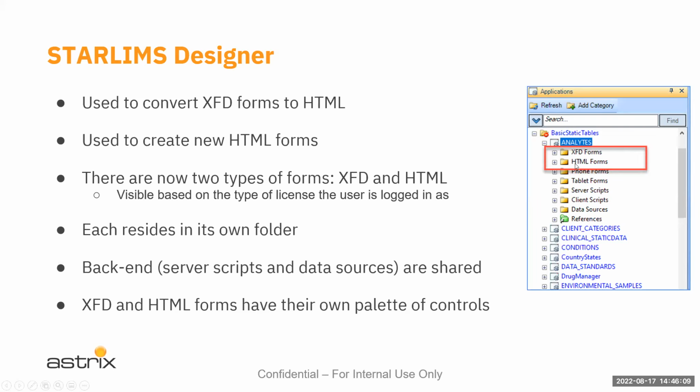So the form here, if you modify it, does not change, obviously, the HTML form. It's a copy. Okay, however, what didn't change was the server scripts and the data sources. That remains exactly the same. So really the upgrade to this new platform was on the presentation. Everything else stayed STARLIMS, right? So if you're coming in from an old STARLIMS and you know STARLIMS back in the days, what you just need to catch up on now on this new system is just the forms, the presentation. Everything else would remain the same. But for you guys, it doesn't matter because it's all new, right? So you're starting from scratch here.